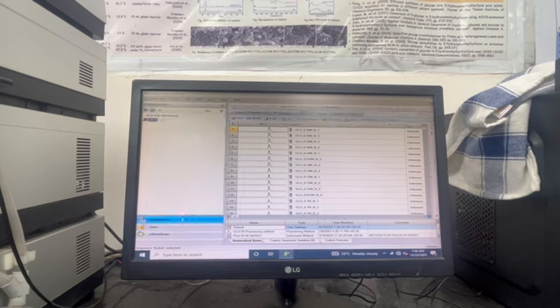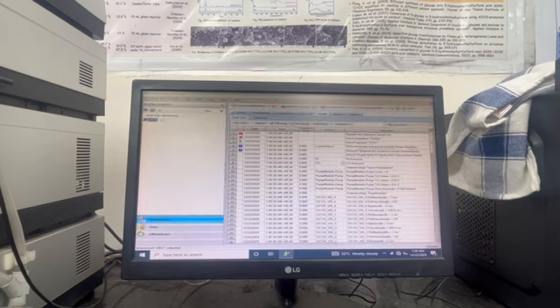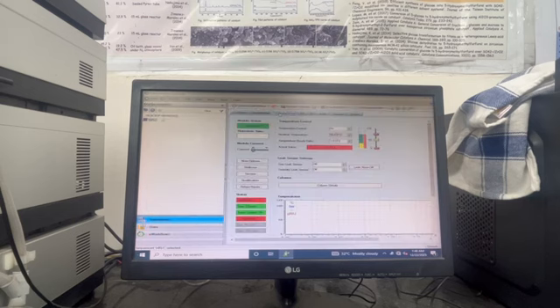Okay, so I will go to the column and I will make this one 30, so that it will be green. Once it is not green, it will not work, because it was previously 50; my analysis used to be performed at 50, that's why. So this was not ready, that's why it took time.